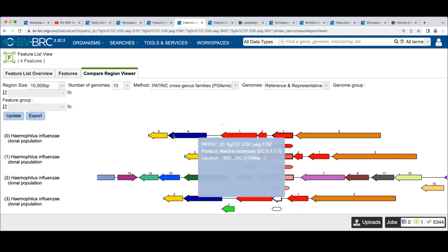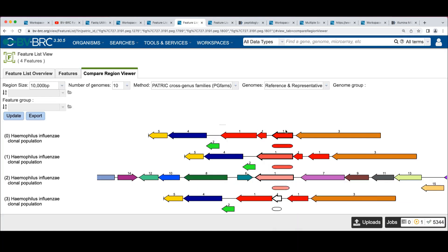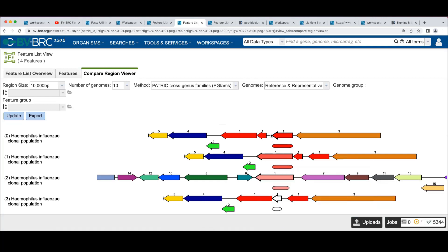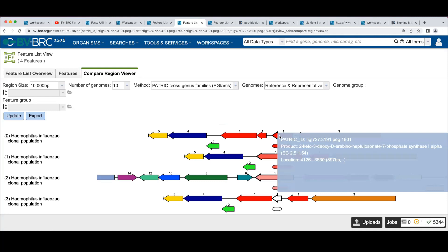And if you look at what these lines are, we've got three rows in this display that are exactly the same piece of the same contig. This first row, the second row, and the last row are each centered on a different chunk of this possibly frameshifted gene. So the other interesting thing is that this one that is on the long contig, this is one little contig, and this is a longer contig.